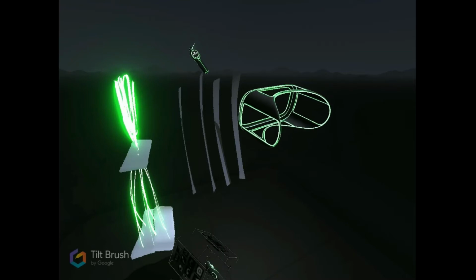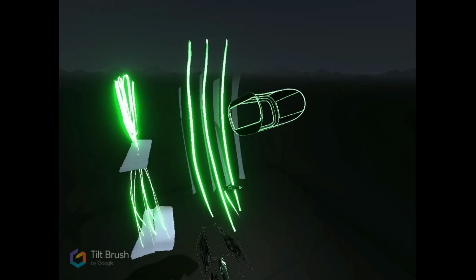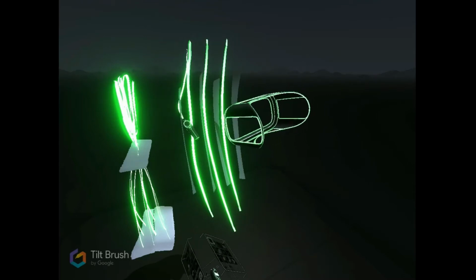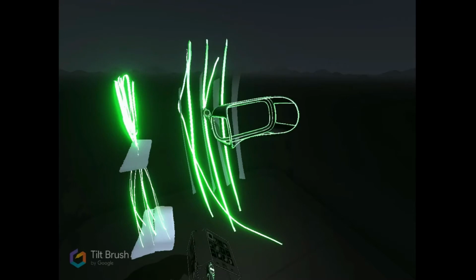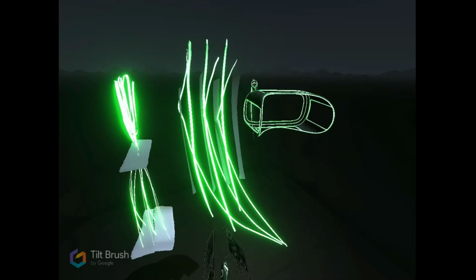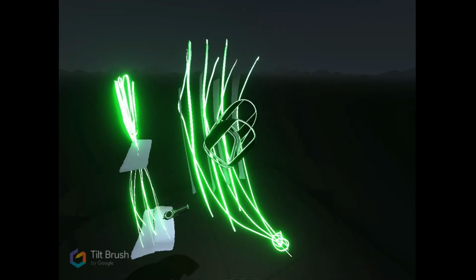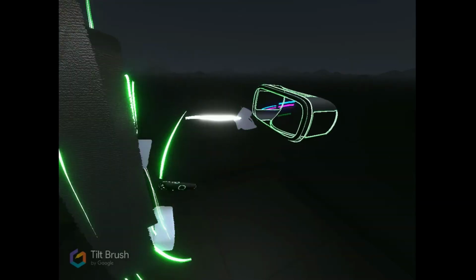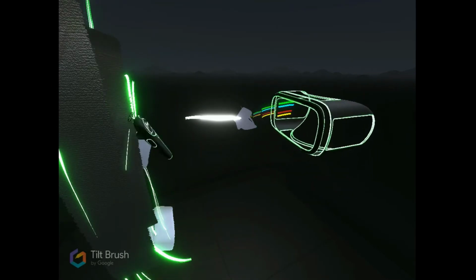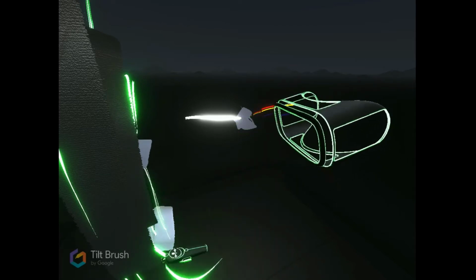So then you have your electron beam, and most of it just goes straight through in between the planes of atoms. But some of it bounces off and goes in at a certain angle in a certain direction. And all of these together make one of the spots, like one of the spots right here. Only because it's a lot less likely for it to hit that specific angle than it is to go through all that space in between.